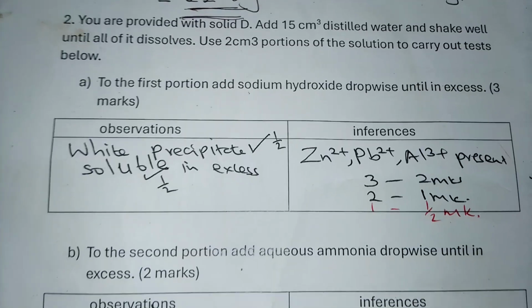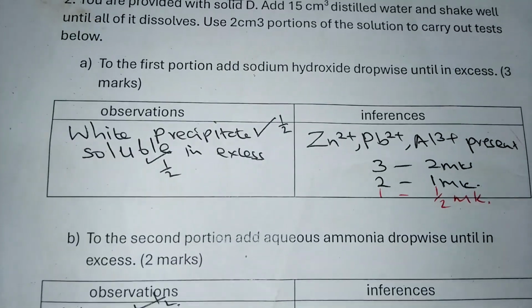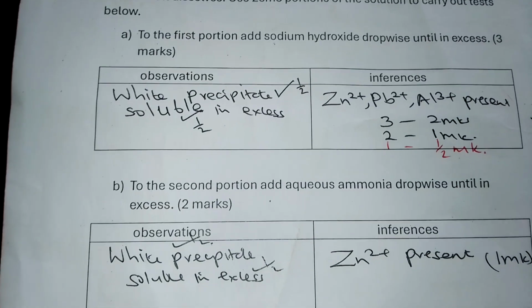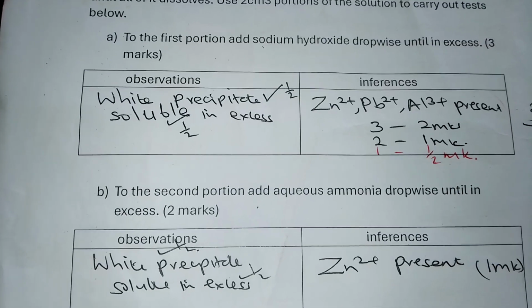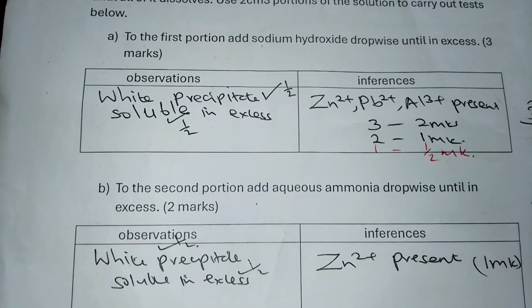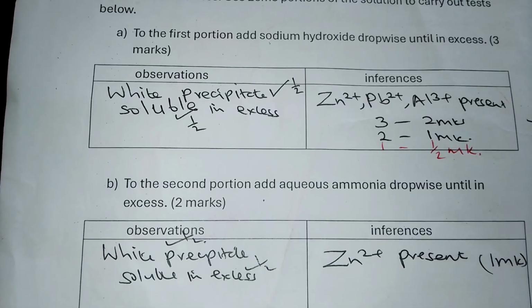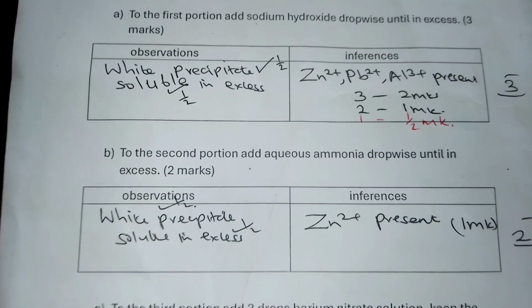To the first portion, we added sodium hydroxide dropwise until in excess. The observation made was a white precipitate soluble in excess, and we concluded that the solution contained zinc ions, lead ions, or aluminium ions.